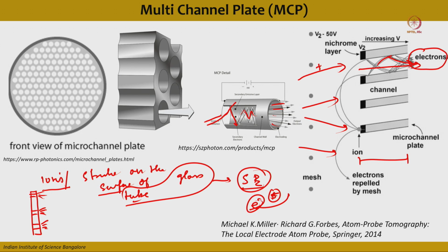For that purpose there is a phosphor screen, and this phosphor screen is coated with a transparent conductive layer, which is mostly indium oxide.